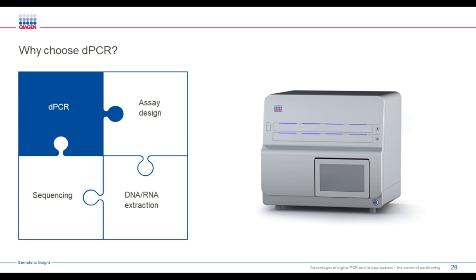But what you need to think about is that you need to be able to do an assay. And if you don't have the sequence, as I mentioned before, then you need to actually sequence the DNA to be able to get the sequence so you can create an assay. But of course, it's also important that you have a good extraction method. And QIAGEN has a variety of extraction kits for different and tough samples, but this is crucial.